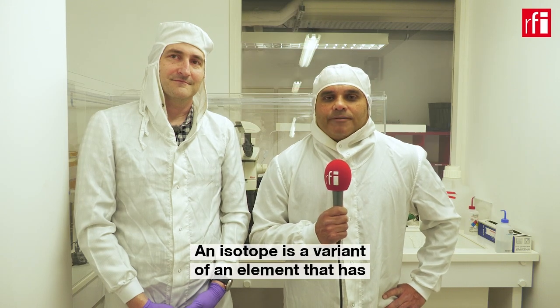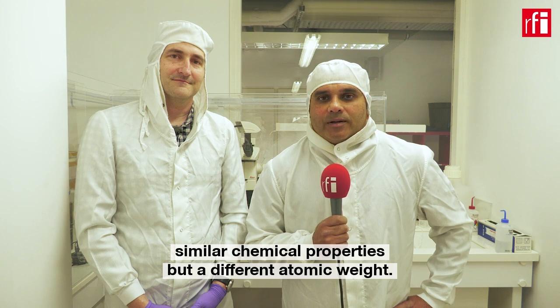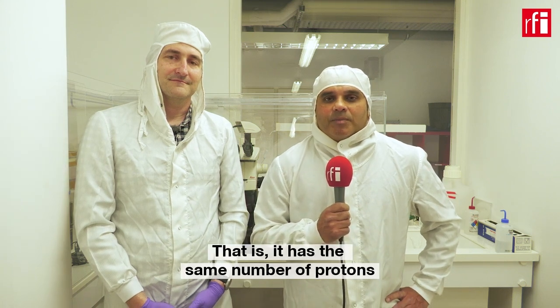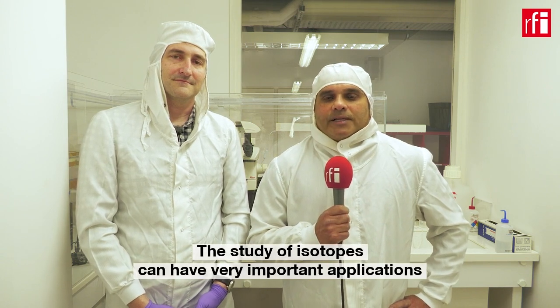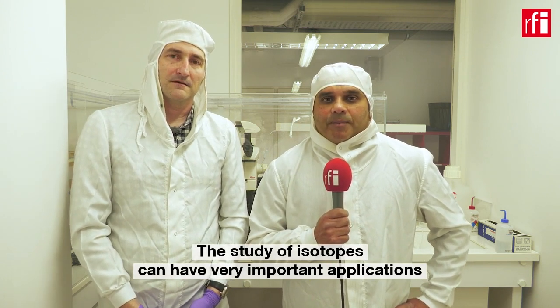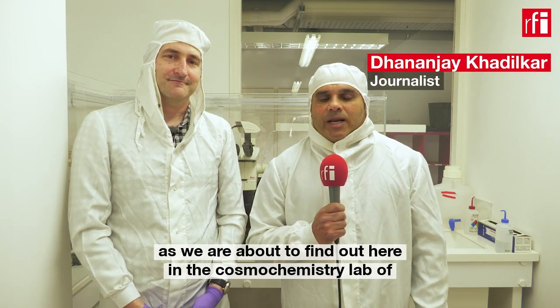An isotope is a variant of an element that has similar chemical properties but different atomic weight. That is, it has the same number of protons but a different number of neutrons. The study of isotopes can have very important applications, as we are about to find out here in the cosmochemistry lab of the Institut de Physique du Globe de Paris.